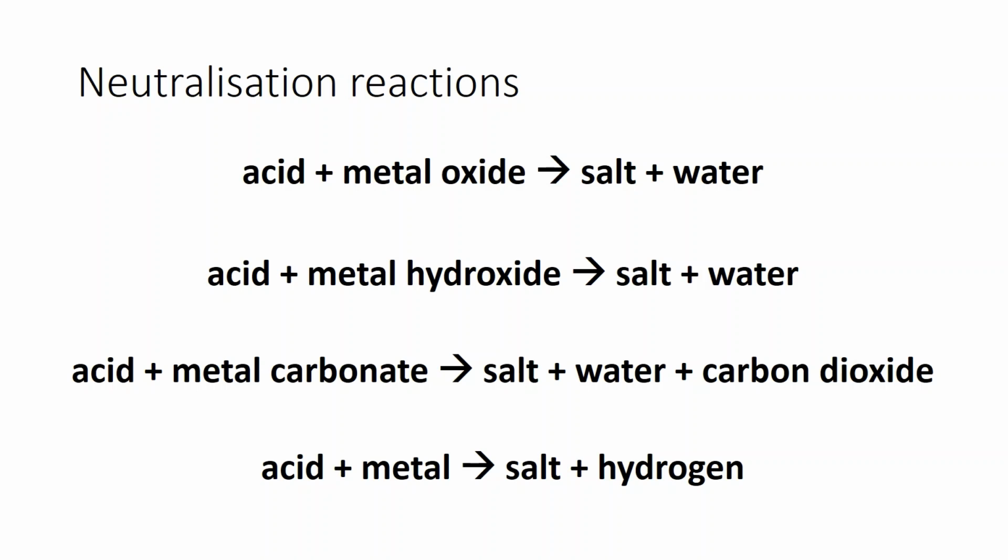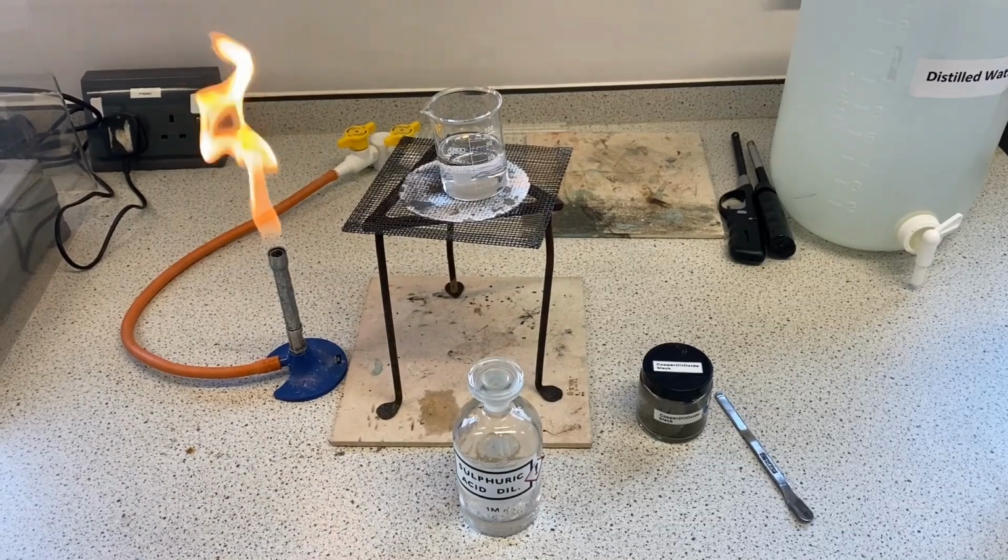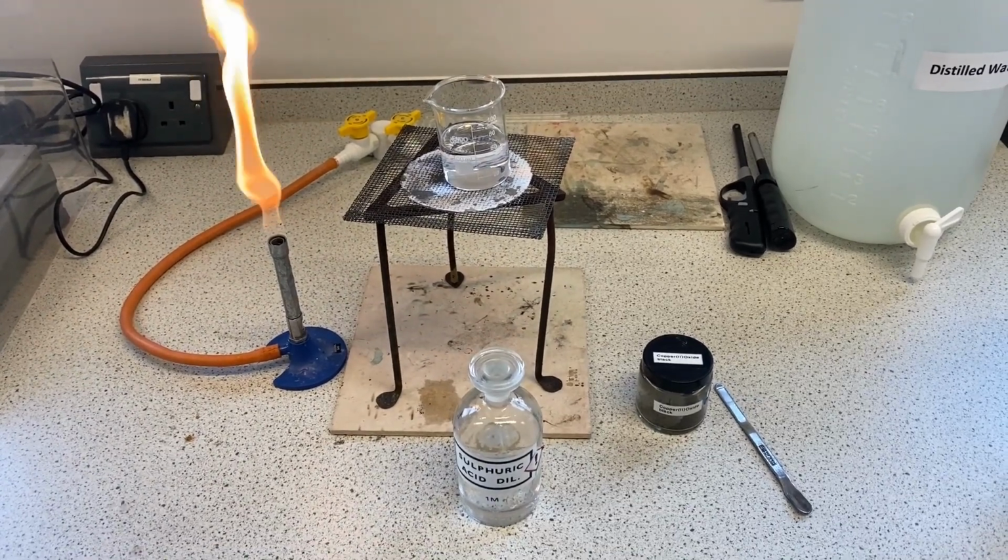And the required practical could ask you about any of these reactions. Typically, they like to ask 6-mark questions about these required practicals, as we saw in our last video lesson. Today we're going to make copper sulfate.